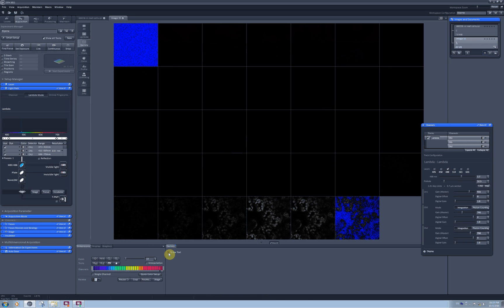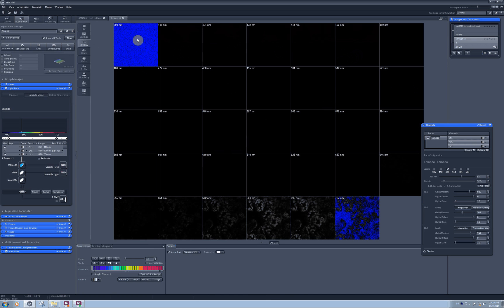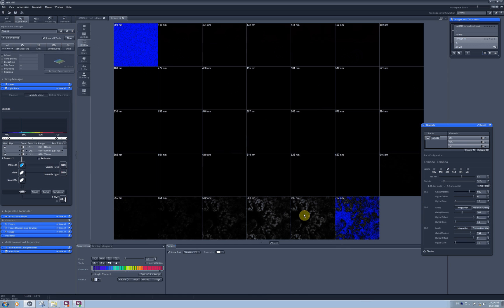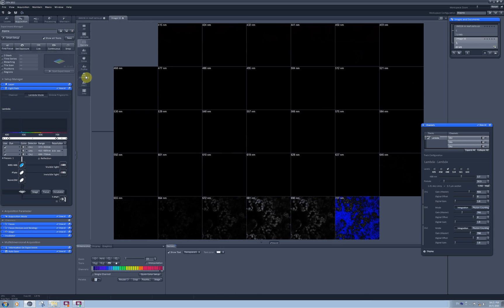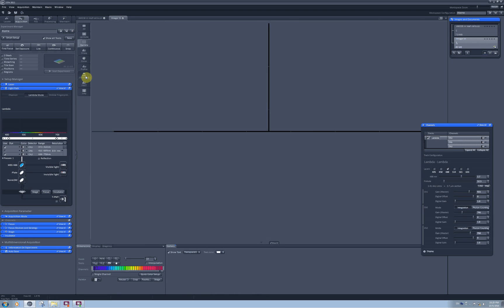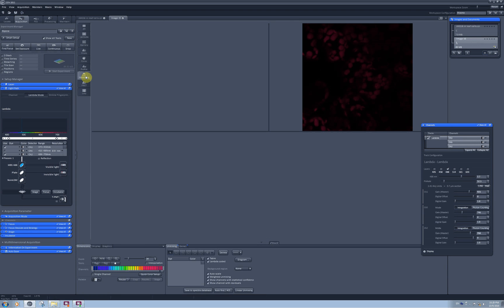Show text visualizes approximately what range of the spectrum was detected by each of the detectors. So it will be 610 plus minus approximately 5 nm. You can proceed to unmixing tab to create the spectrum from the image you just acquired.